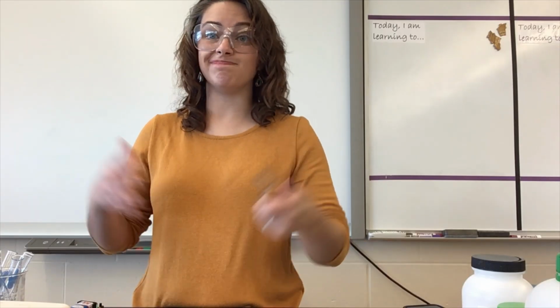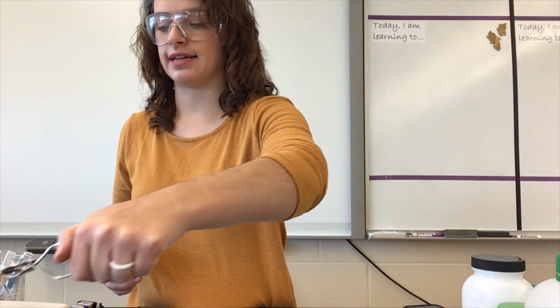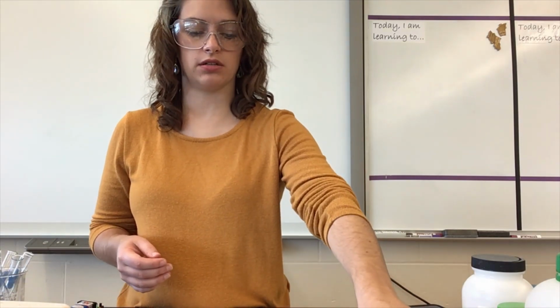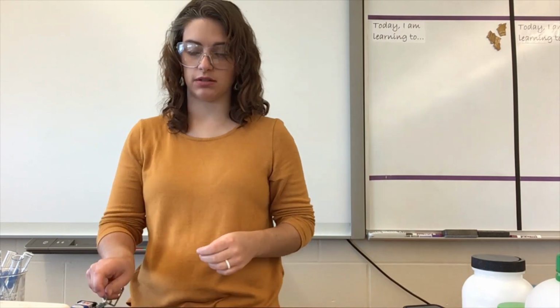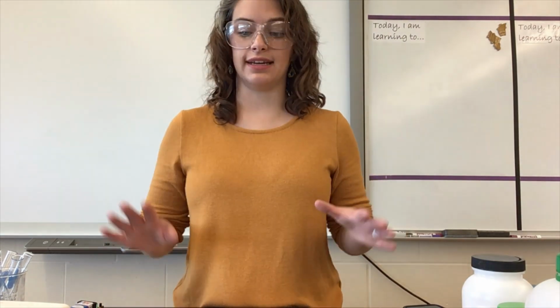Okay, so that's about a minute. It didn't do anything. So it has a high melting point because it did not melt at all. Okay, last one is naphthalene.